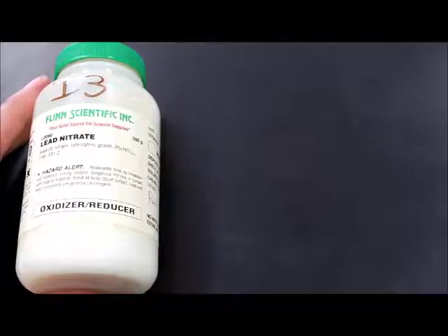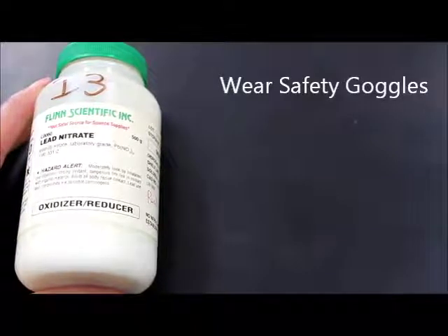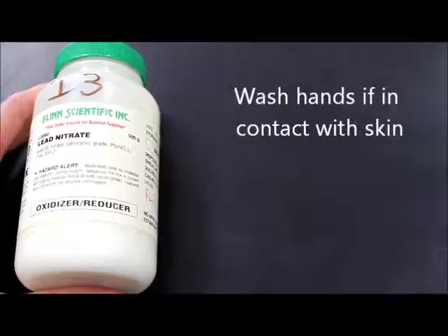So you want to make sure that, first of all, you're wearing your safety goggles all the time. That way you can't rub your eyes. And second of all, if you get any of this on your hands, just make sure that you rinse it off in the sinks, use some soap, wash your hands, and make sure that we get rid of that.